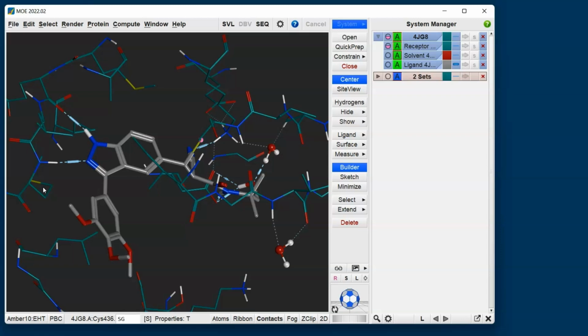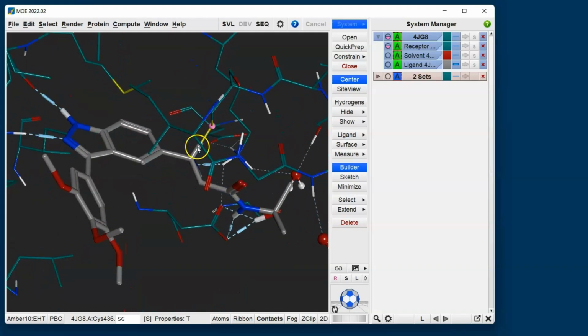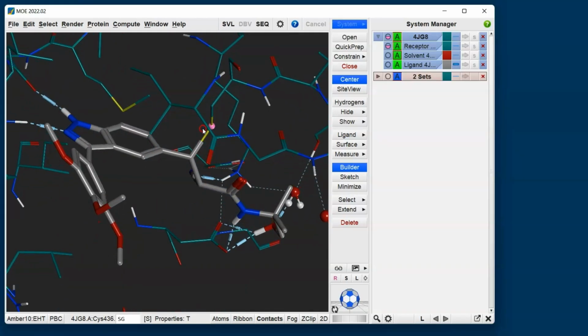So for that, I'm going to do covalent docking for each of the ligands to see how they will fit if they react with the same cysteine. But before I can react with this cysteine, I need to prepare the cysteine so it's ready to accommodate a new ligand. That means I need to break this bond between the ligand and the current cysteine.